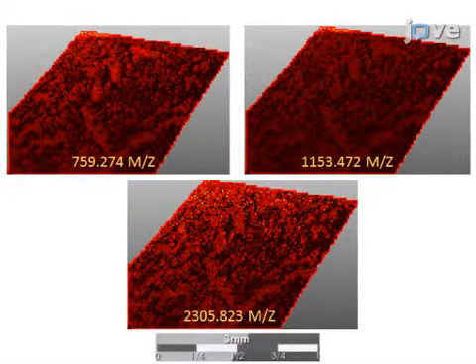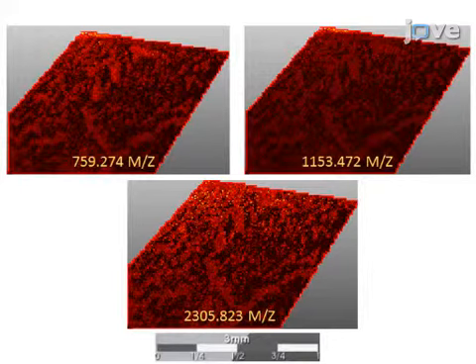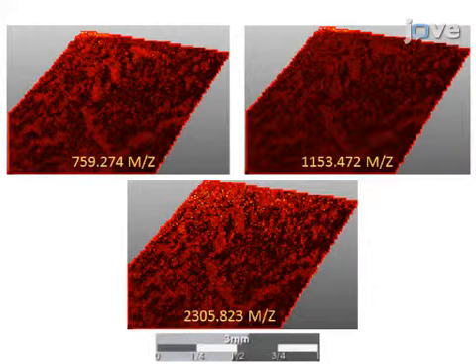By contrast, this incorrectly prepared sample shows a large scale level of delocalization. The patterns of the molecules present across the 3 panels clearly demonstrate that there is no clear definition between biological regions or differences in the abundance of the molecules displayed.